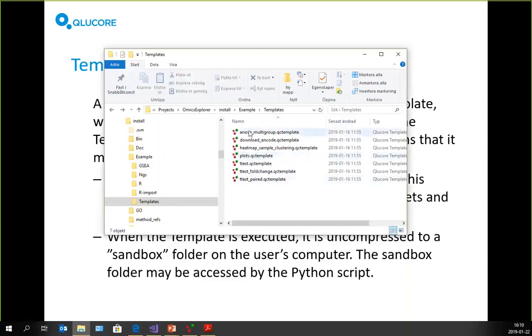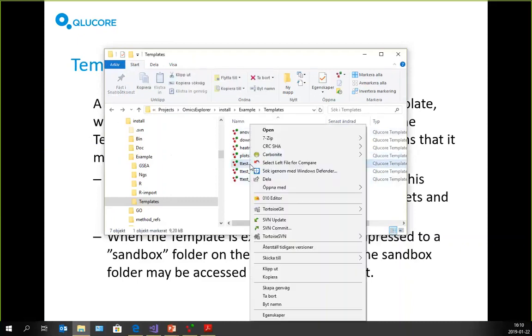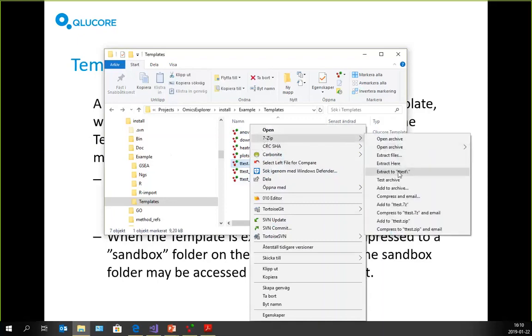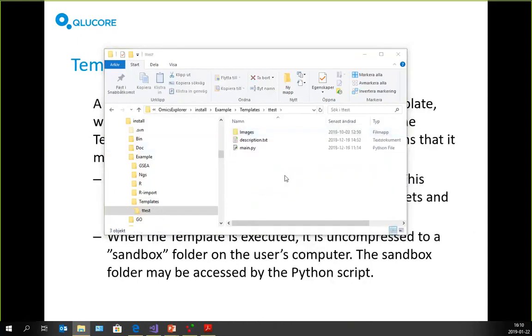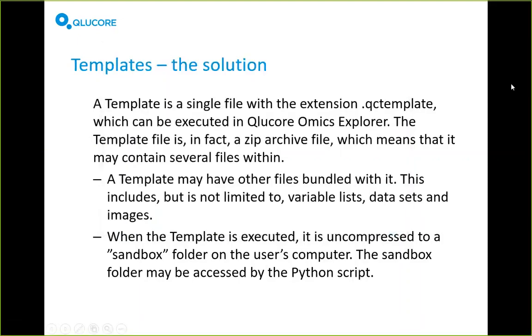These are basically zip files that have been renamed with the QC template extension. When Cluecore Omics Explorer is installed, a QC template file is associated with the software. So if you double-click on it, it will start Omics Explorer and execute the template for you. If you drag and drop it onto Cluecore Omics Explorer, it will execute as well. There are different ways to execute templates.